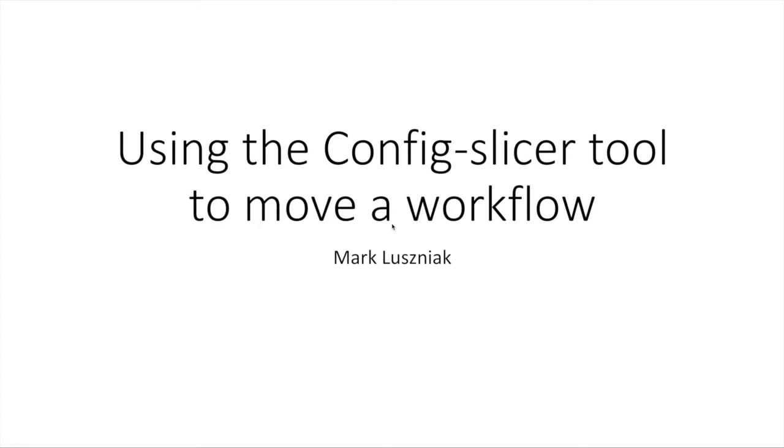Hello, in this recording I'll provide an overview of using the config slicer tool to move a workflow from one Clarity system to another. So if we think about this, we've got the source Clarity system on the left and the destination Clarity system on the right, and obviously we want to export from one system and import it into the other system. So how does this work?